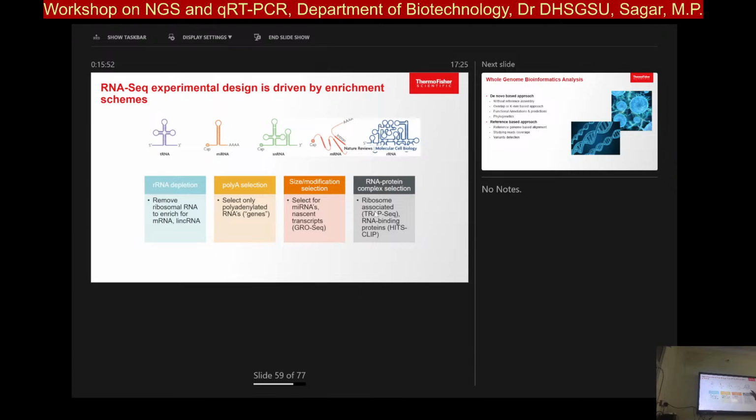Okay, with that, how the RNA would be more precise is with the total RNA, when you are doing an RNA depletion. That is one, but you can do a selective one, poly A region. So only tagging poly A and segregating them out. So certain studies need poly A based tagging out. So you must be knowing, right? When your transcript is formed, at the end you have poly A regions in there. So there are certain tagging methods where poly A will be picked up and you are sequencing them.